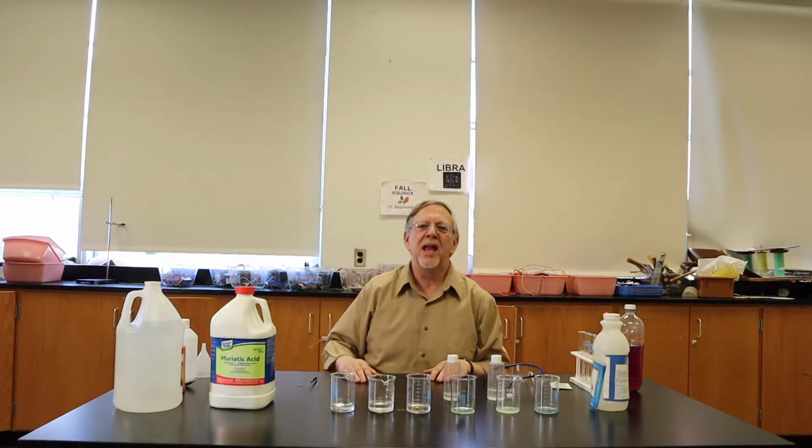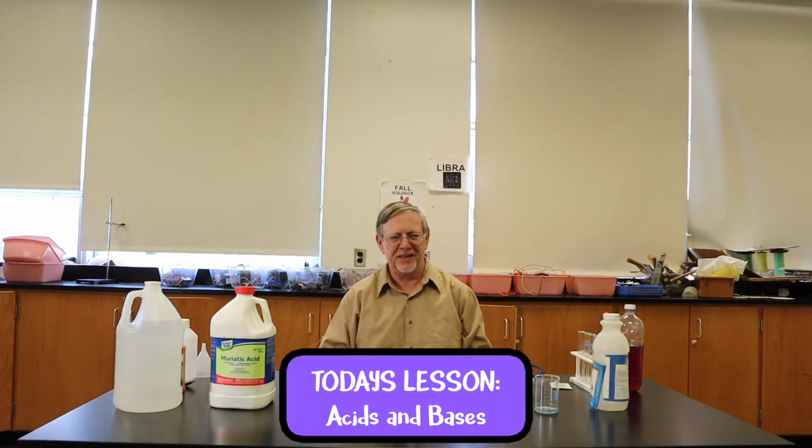Welcome to the 4th episode of Uncle Ron's Academy. Today we are going to be doing some chemistry experiments involving acids and bases.